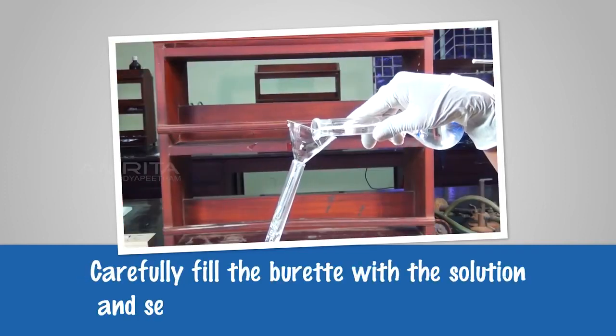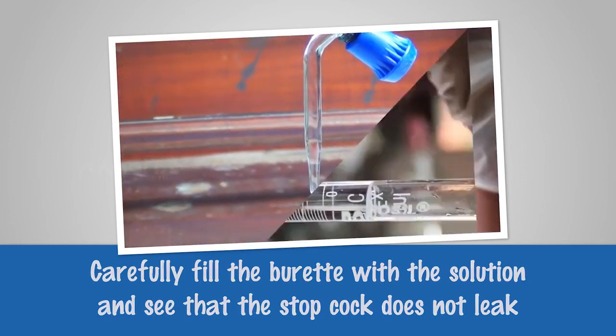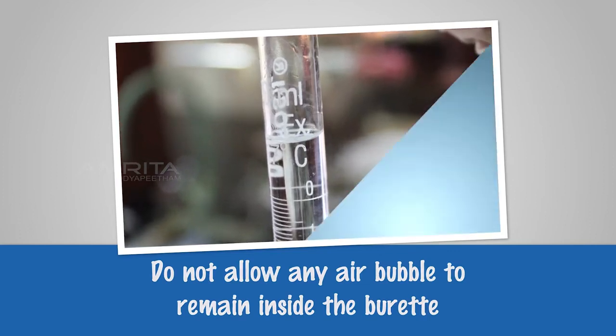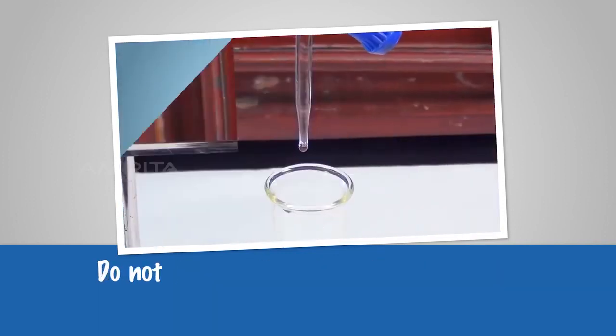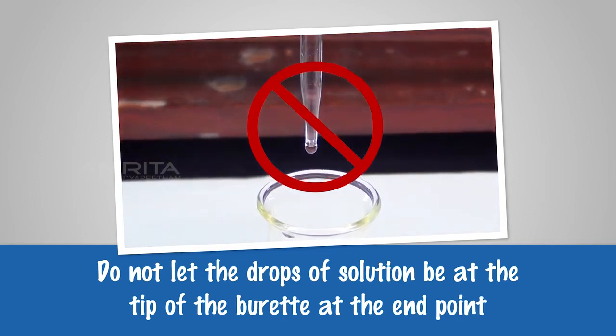Carefully fill the burette with the solution and see that the stopcock does not leak. Do not allow any air bubbles to remain inside the burette. To take the reading, place the eye exactly at the level of the meniscus of the solution. Do not let the drops of solution be at the tip of the burette at the end point.